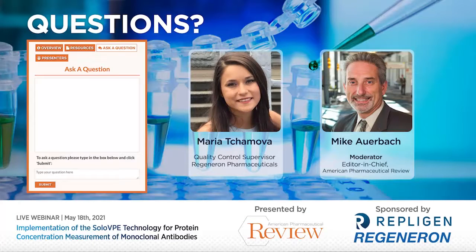There's a lot less analyst preparation, a lot less calculation. So it's faster to train operators to use this technology, and it's also easier on our end to troubleshoot any issues that they have, since there's so much detail output by the software itself that can help us understand what goes on with each measurement.